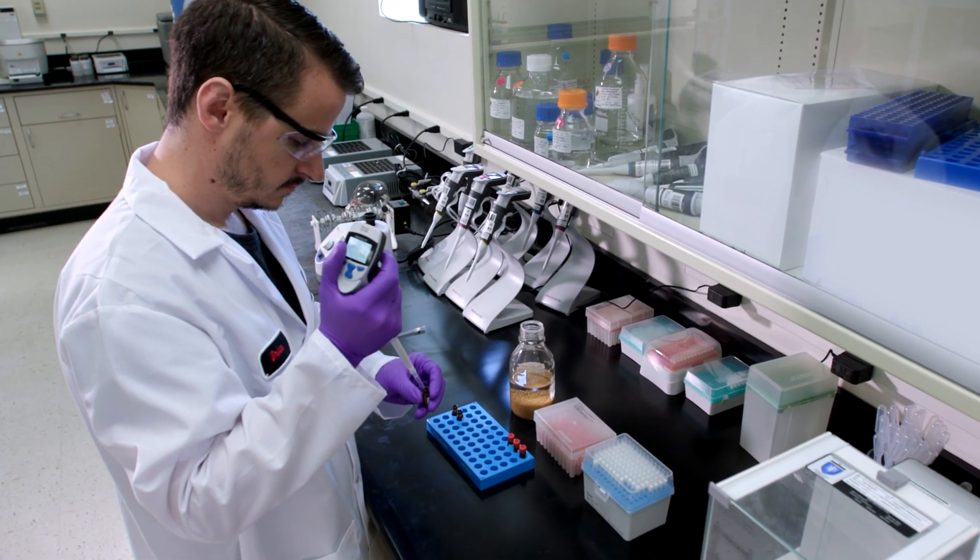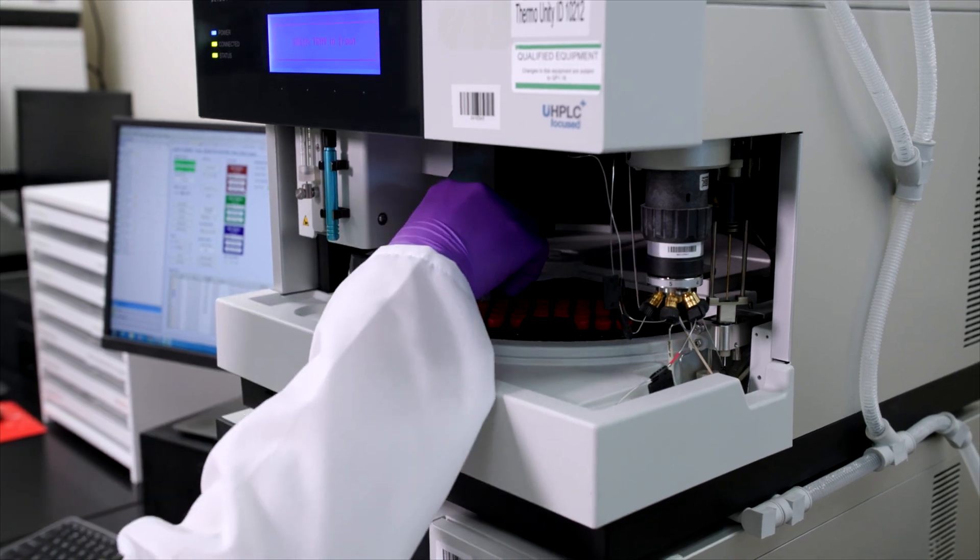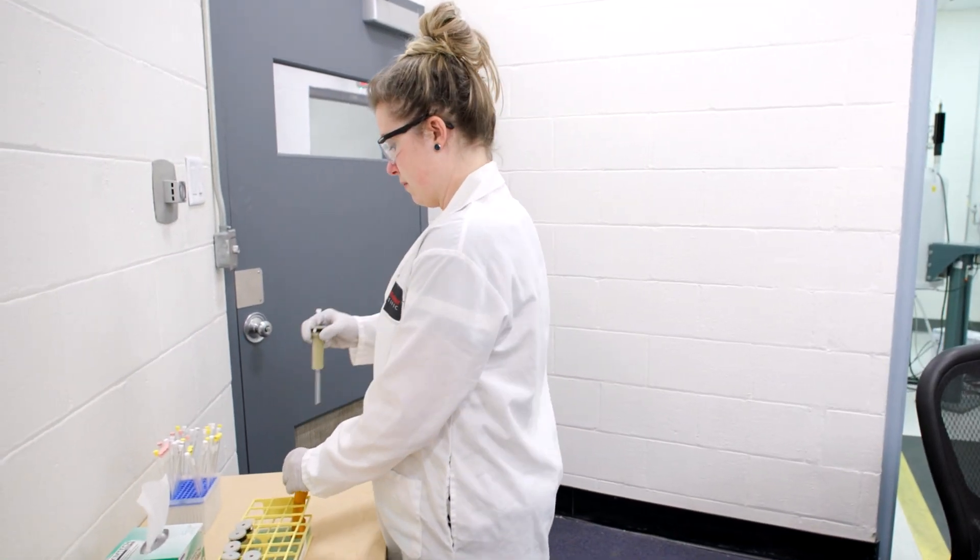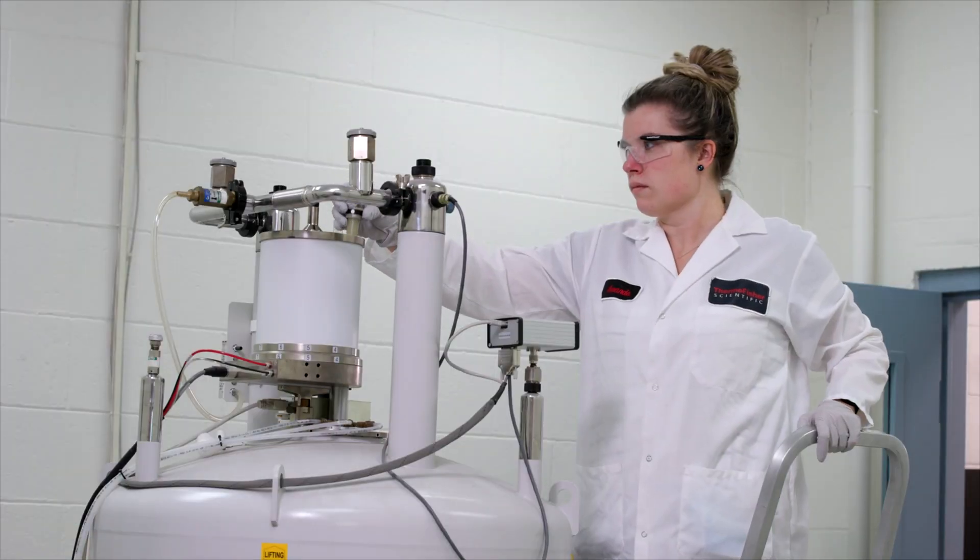In addition, our quality assurance team works with you to understand your individual quality needs, such as tailoring specifications, transferring methods, and setting up stability studies.